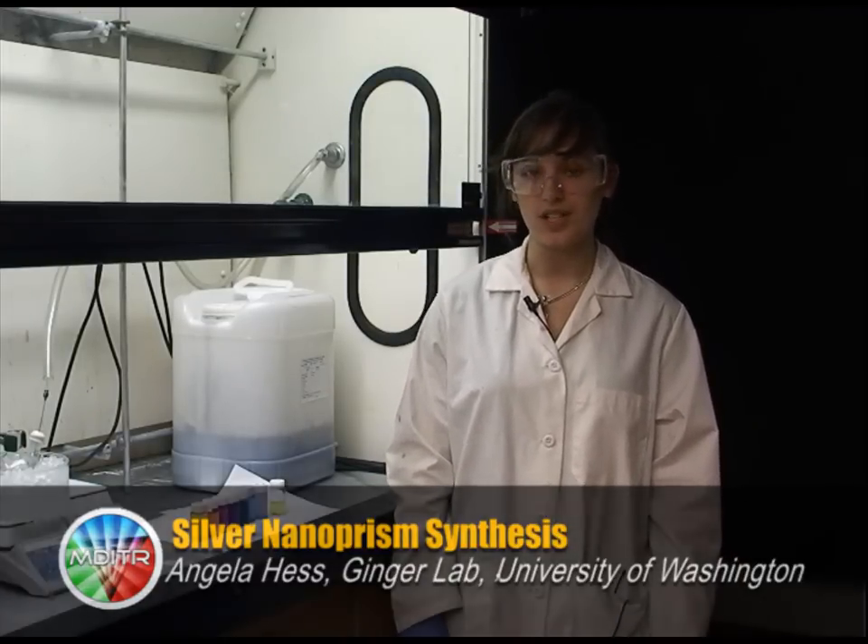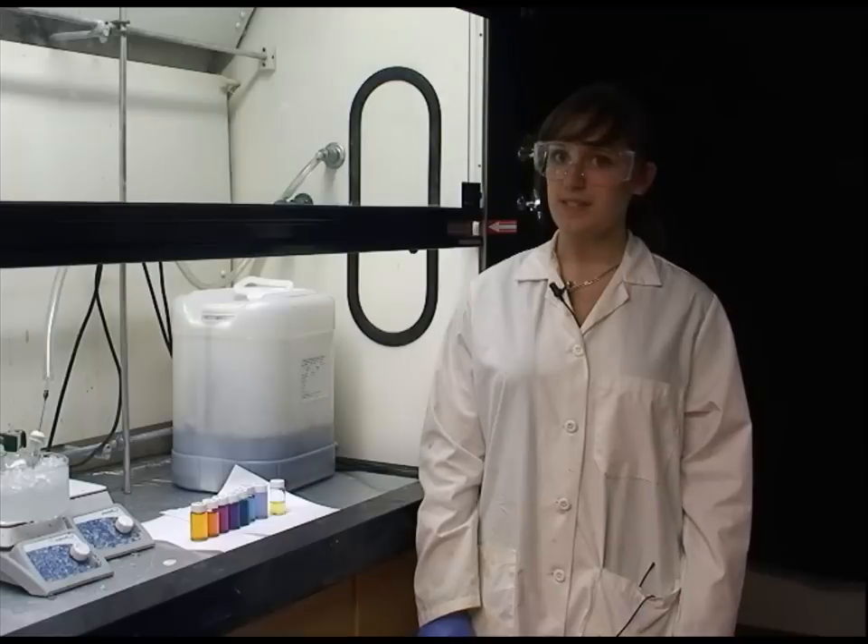Hi, my name is Angela Hess and I'm here at the Ginger Lab at the University of Washington. I will be synthesizing silver nanoprisms today.